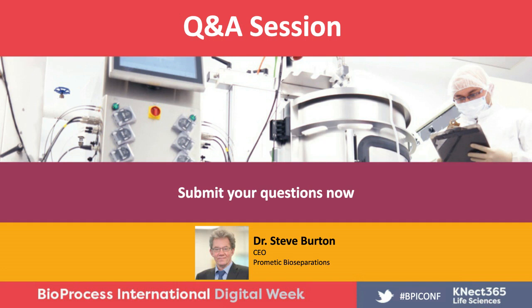What if I find a ligand that binds my target, but not at the capacity I need? That's a good question. Generally speaking, for impurity removal, for polishing steps, the capacity required isn't very high because generally speaking, it isn't a large amount of those impurities present, certainly not after an affinity capture step. But in some cases, it can be an issue.